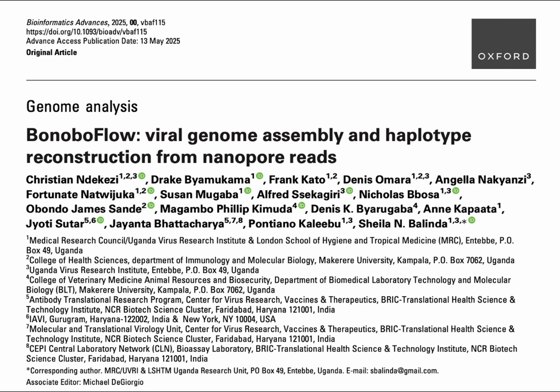And for RNA viruses like HIV, which mutate incredibly fast and generate huge diversity, this is not just a technical win, it's potentially a game changer. Why is finding those multiple haplotypes in one sample so important, especially for HIV? Because it means we can finally start to map the full genetic picture within a single patient.